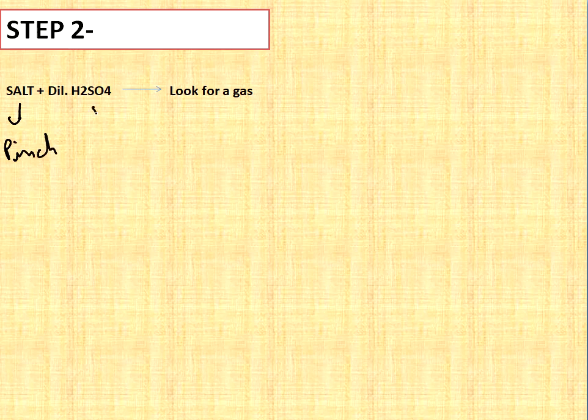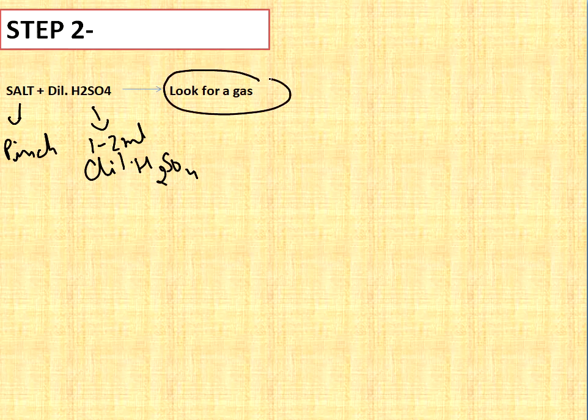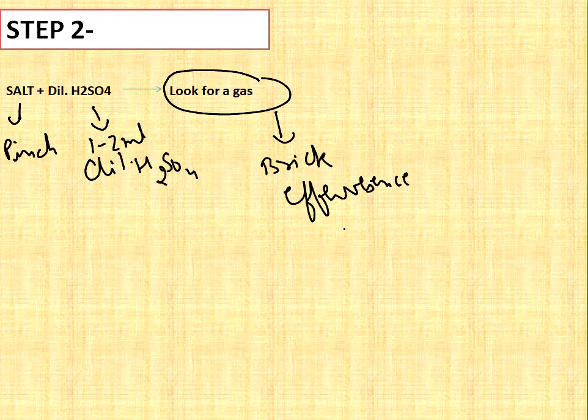Add dilute H2SO4 to a pinch of salt. How much dilute H2SO4 you have to add? You have to add one to two ml H2SO4 dilute. Now after adding dilute H2SO4, you have to look for the gas which is evolving.